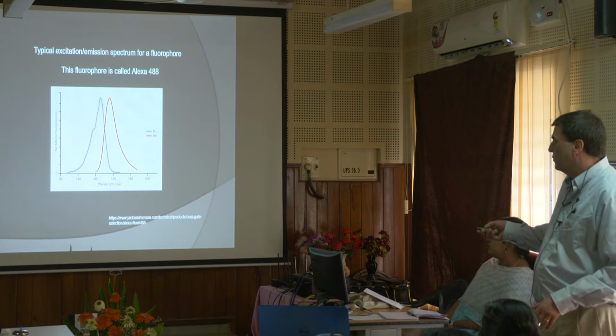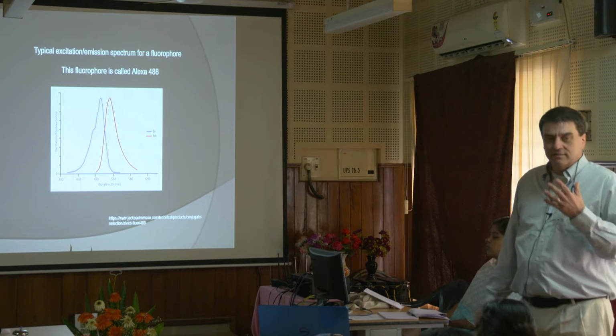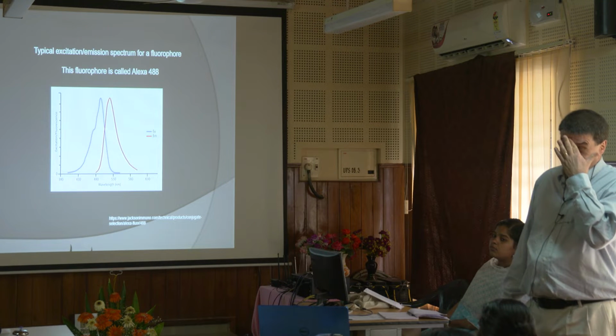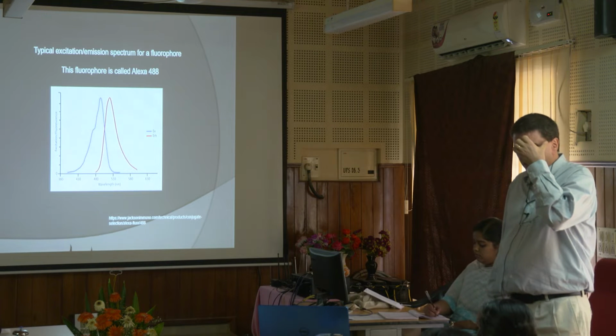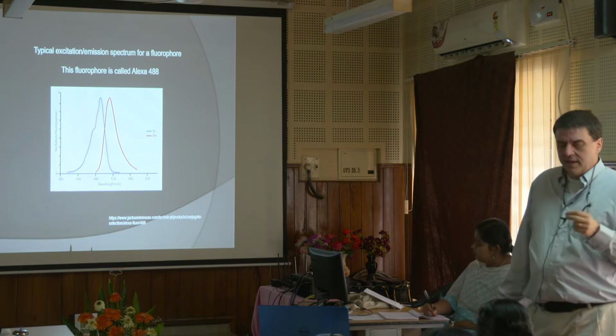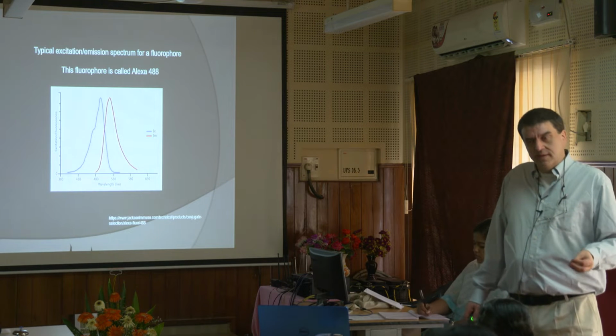This one's called Alexa 488. Again, one of my favorites. The Alexa dyes came out 10, 12, 15 years ago. They're very, very well-made dyes. They work very well on a confocal. They're very bright, and they do not bleach.